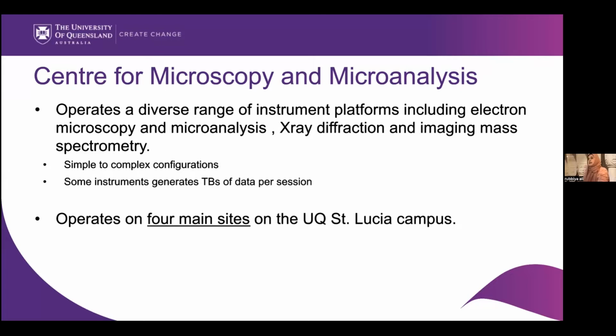CMM, I think most of you know us. It's UQ's microscopy, characterization, and microanalysis core facility, and it is also part of the National Grid of Microscopy Australia facilities. We have a diverse range of instrument platforms, including electron microscopy and microanalysis, X-ray diffraction, and imaging mass spectrometry.